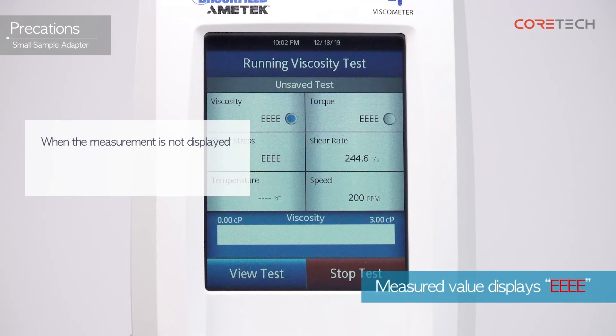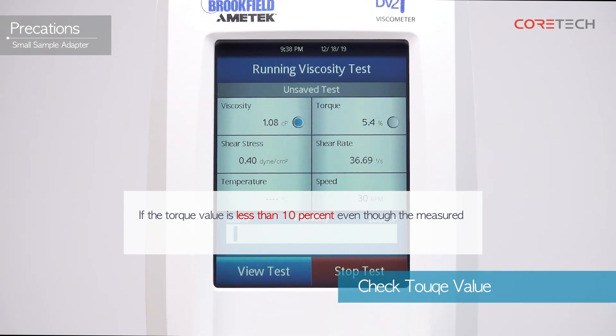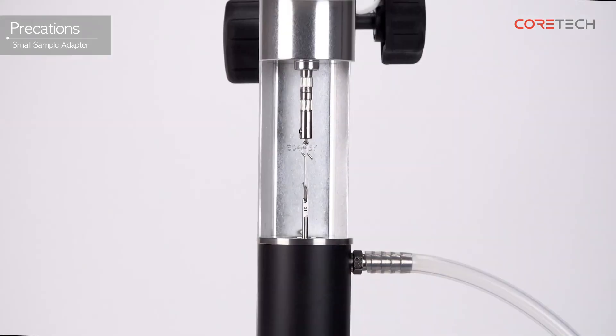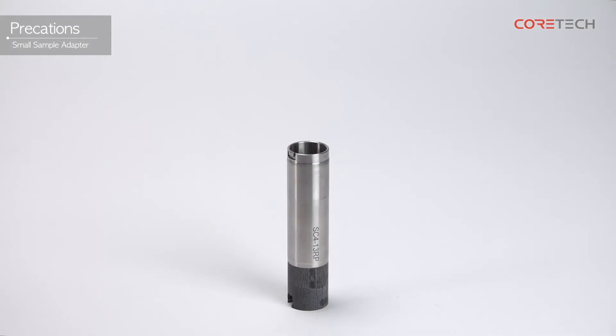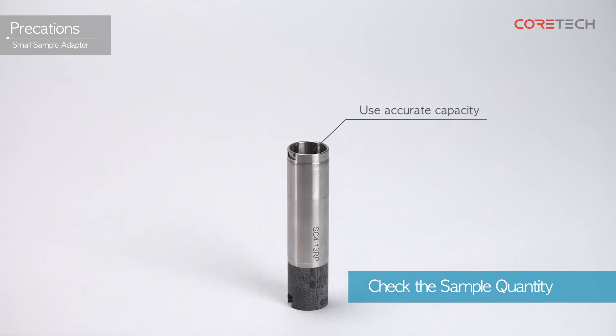If the measurement is not displayed and 'E' is displayed, reduce the rotational speed and measure again. If the torque value is less than 10% even though the measured value is stabilized, measure again by changing the rotational speed. Make sure that the temperature of the sample does not exceed 100 degrees Celsius. If the spindle is impacted, the pivot is more likely to be damaged. Measurement error can occur depending on the sample quantity, so please keep the correct quantity.